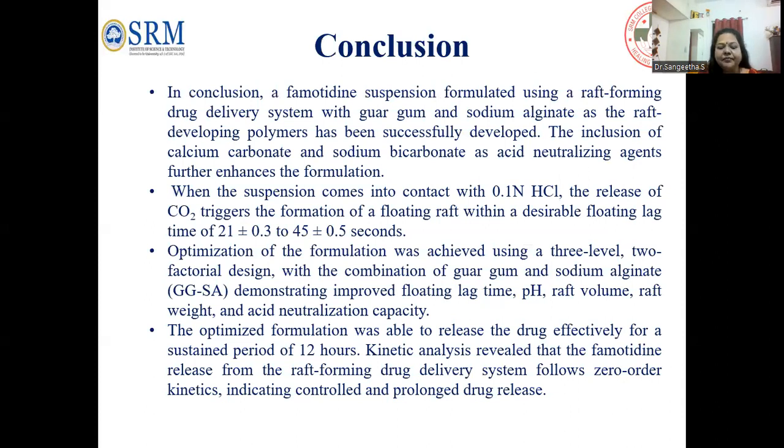In conclusion, a famotidine suspension formulated using a raft-forming drug delivery system with guar gum and sodium alginate as the raft-developing polymers has been successfully developed. The inclusion of calcium carbonate and sodium bicarbonate as neutralizing agents further enhances the formulation. When the suspension comes into contact with 0.1N HCl, the release of CO2 triggers the formation of a floating raft, with a desirable floating lag time of 21 ± 0.3 to 45 ± 0.5 seconds observed.